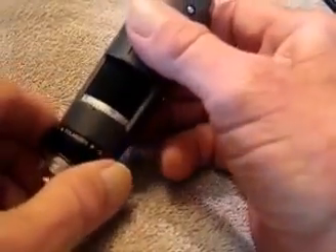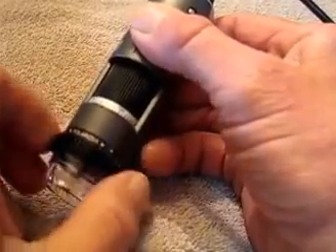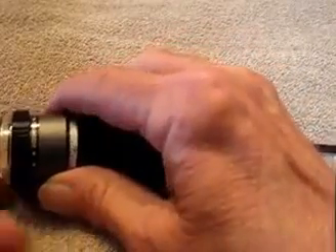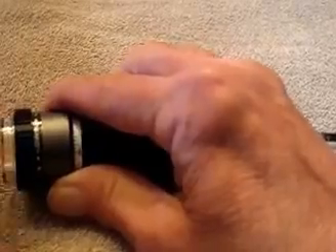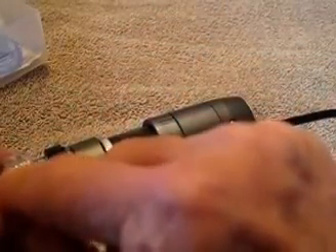Down here is a really nice feature: a built-in polarizing filter. In some cases this may really help you see the image a whole lot better. Down here is a cover — for handheld use you've got a box full of these covers, actually a total of six.